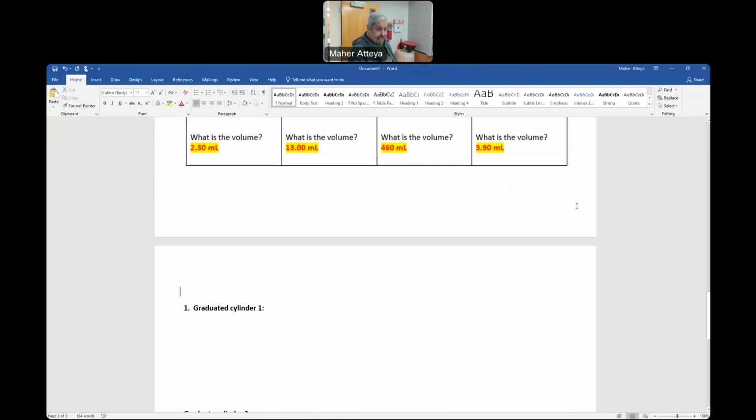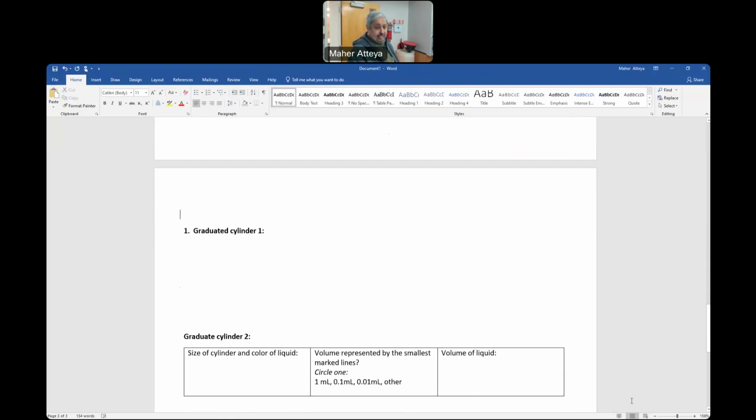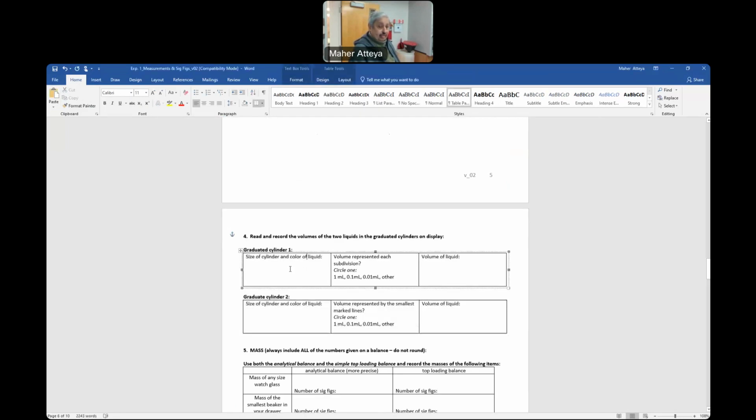It took the first one, it did not take the second one with the copy and paste. So the best thing is you have to fill it in inside and take the snipping tool. You have to put in the liquid, whatever the color is, blue or green. Fill this one here. Okay.